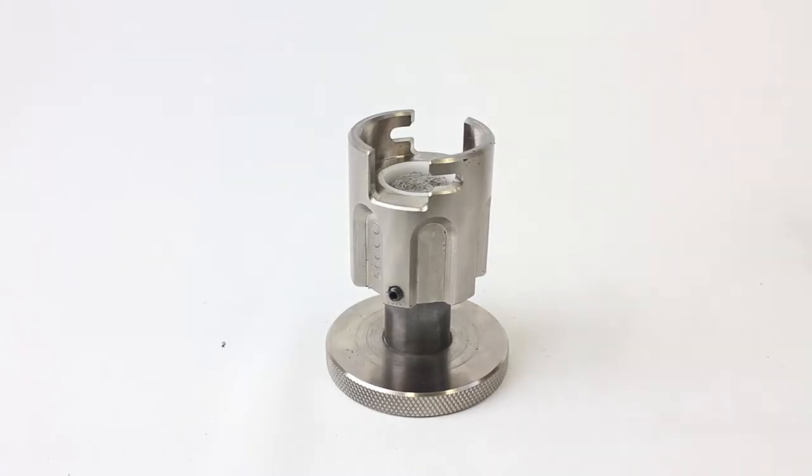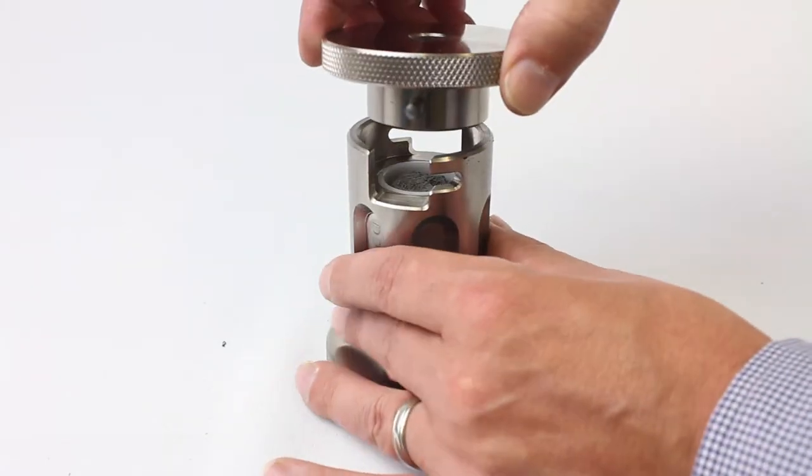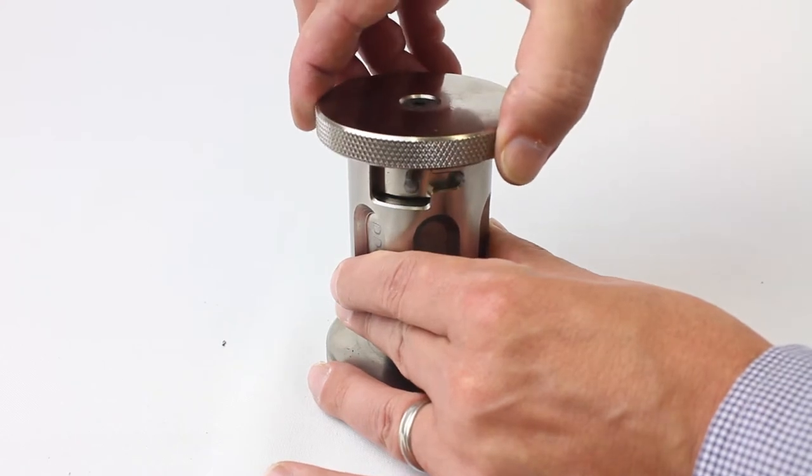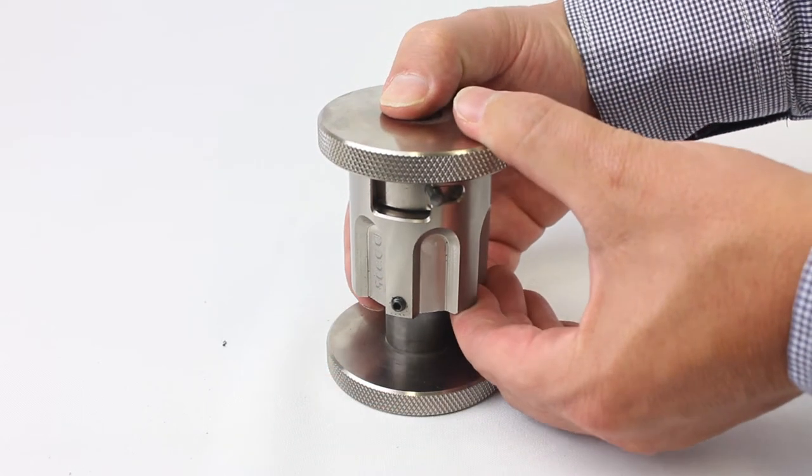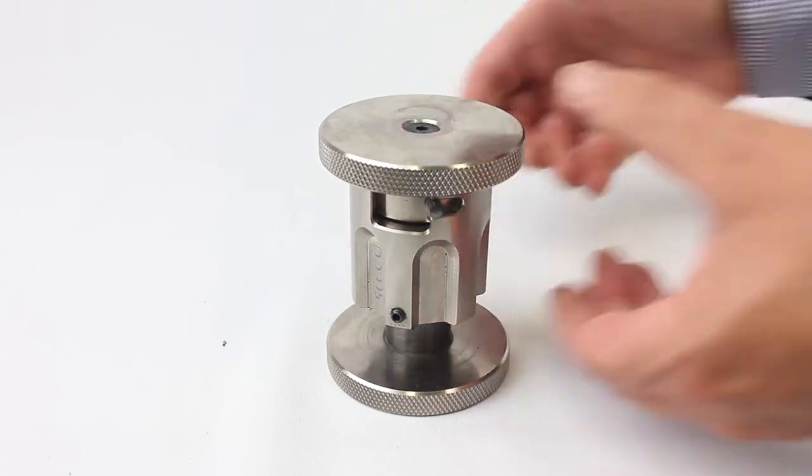Place the lid onto the die and turn to latch the lid. Only turn so that the pin is engaged in the slot. Do not tighten as the lid can become locked. Do not press down on the die until the lid is in place and latched.